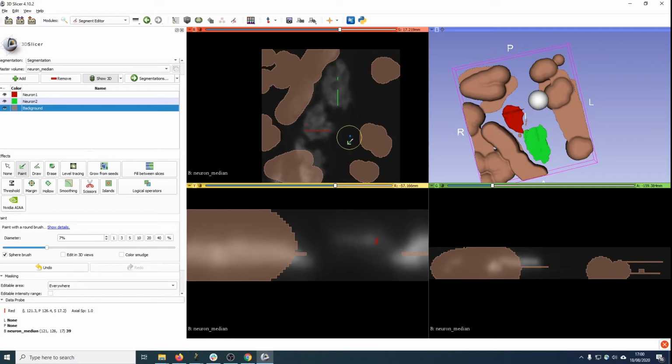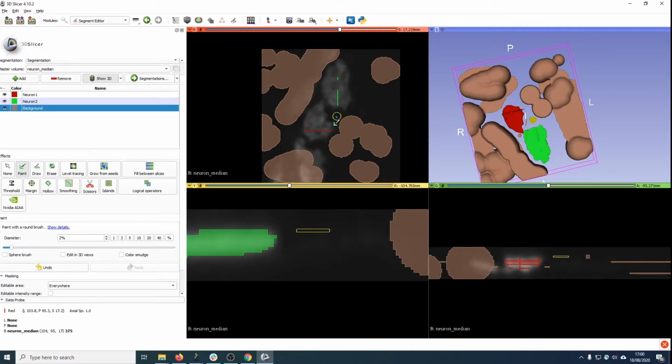All right. Hopefully this should work. I'll just untick that. Maybe I'll just add here. Cool. All right. Let's see what this does. So once we've made all the seeds, sometimes you can get away with even less. It depends on how separated the objects are and how sharp the images are as well. That's where the filtering helps.